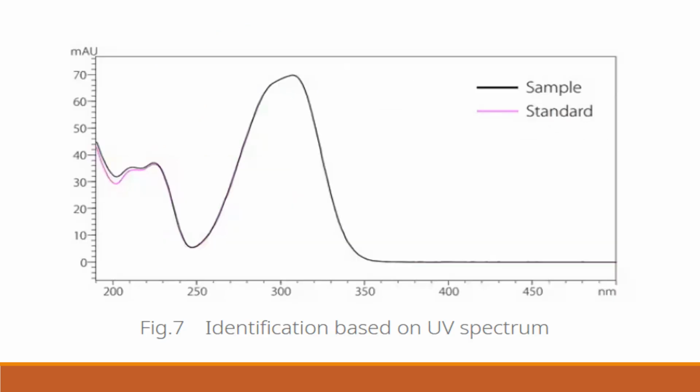Now in this spectrum, this is the identification of peak B when it is detected at a wavelength of 310 nanometer. While in PDA detectors, you all could see that three peaks could be detected, peak A, B and C, because multi-wavelength analysis can be done over there.